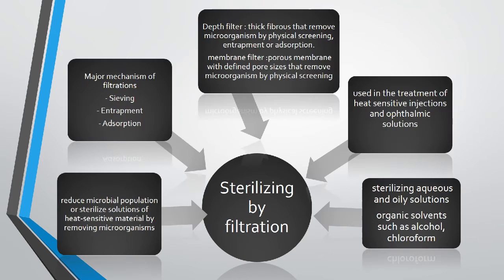Sterilizing by filtration is to reduce the microbial population of heat-sensitive material by removing microorganisms. Three major mechanisms of filtration are sieving, entrapment, and adsorption. Sieving is when a particle larger than the pore size of the filter is retained on the filter. Entrapment occurs when a particle smaller than the size of the pore enters and lodges onto the wall of the channel. Electrostatic attraction causes particles opposite in charge to the surface of the filter pore to be adsorbed onto the surface.